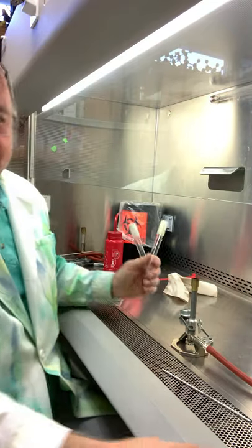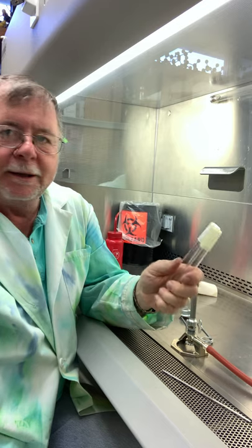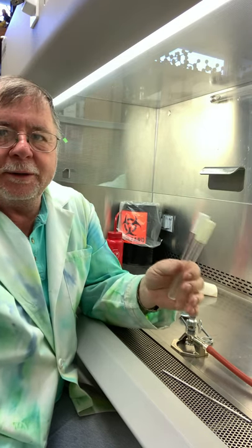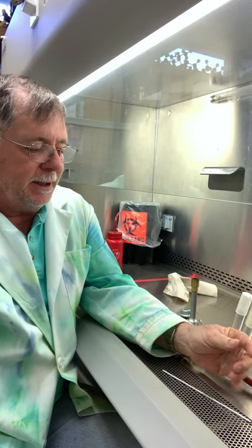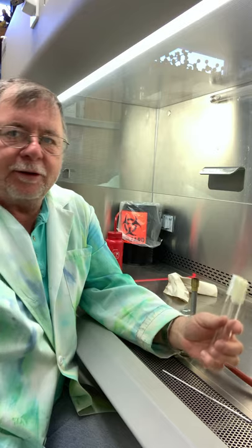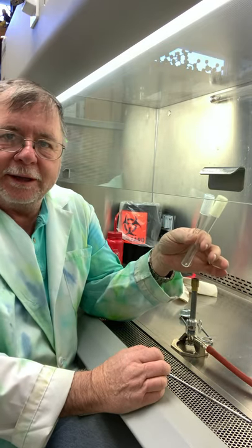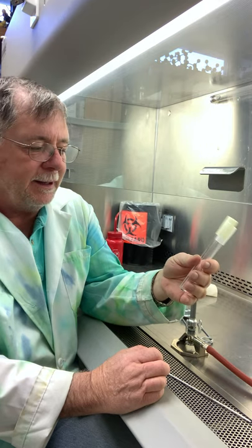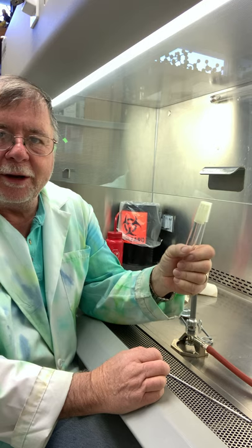Okay, that was it. It goes pretty quick, but it takes practice to get it done in one hand. And it is important that you learn to do it in one hand. You don't want to put one in a test tube rack and another one in a test tube rack and try to do it that way. You want to learn this technique. So that's what we're trying to teach you, is the technique. And so part of that technique is to handle the tubes with one hand. And so you just kind of roll them around.